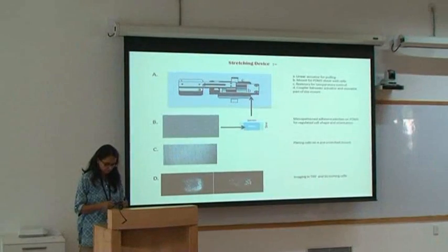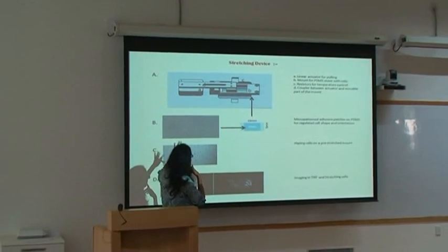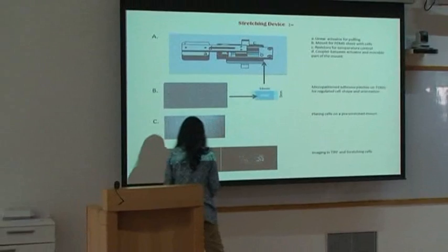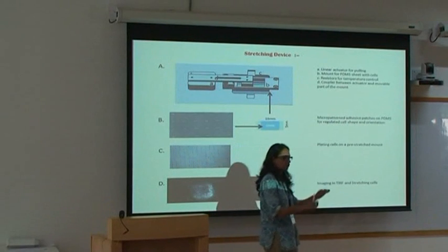I don't have too much time. So again, this is what I showed yesterday, and it's fine. We have sort of covered it. You can either micropattern or just have cells get the right kind of density. And because we have thin PDMS, we could even push it and try to do TIRF.